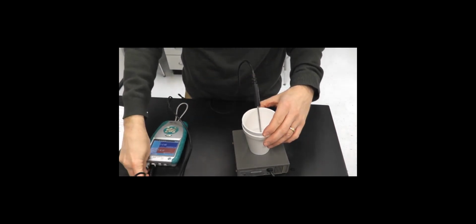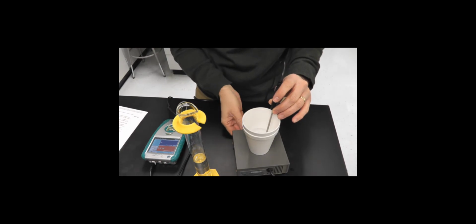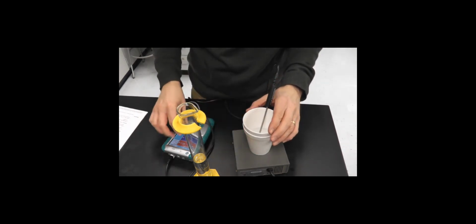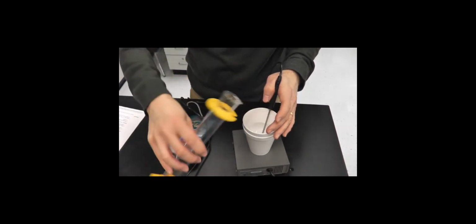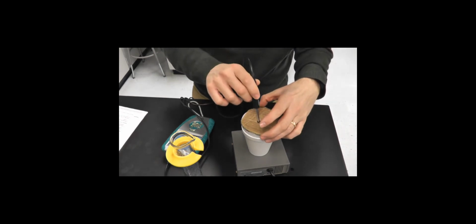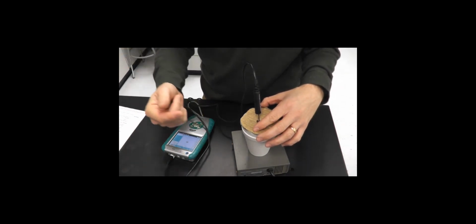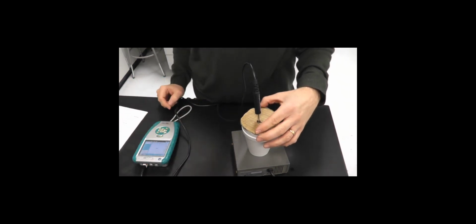Put that in there. Pour this one in there. Actually, start stirring. All right. Pour. Start collecting data. And again, we're going to collect data for 3 minutes. I'm recording the temperature every 20 seconds. And we're going to see how exothermic or endothermic our reactions are.